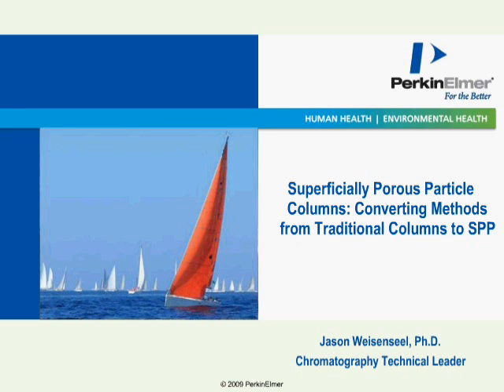The session will begin with a discussion about the basics of SPP columns, followed by a detailed review of guidelines for migration of both isocratic and gradient HPLC methods to these columns. We will end with a discussion on how to optimize your HPLC system to take full advantage of the powerful capabilities of SPP columns.